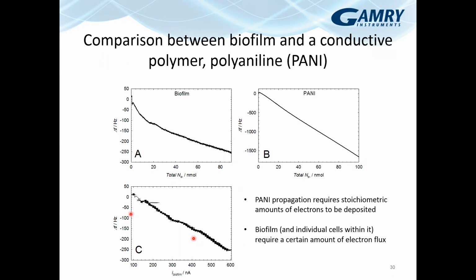You tend to expect a linear response with current, and this makes sense because the original assumption is that current is a proxy for respiration. Well, this is proof, because for every amount of biofilm formed on the surface of the electrode, you will get an increase in current. Right? And this is kind of the power of EQCM for studying EABs.